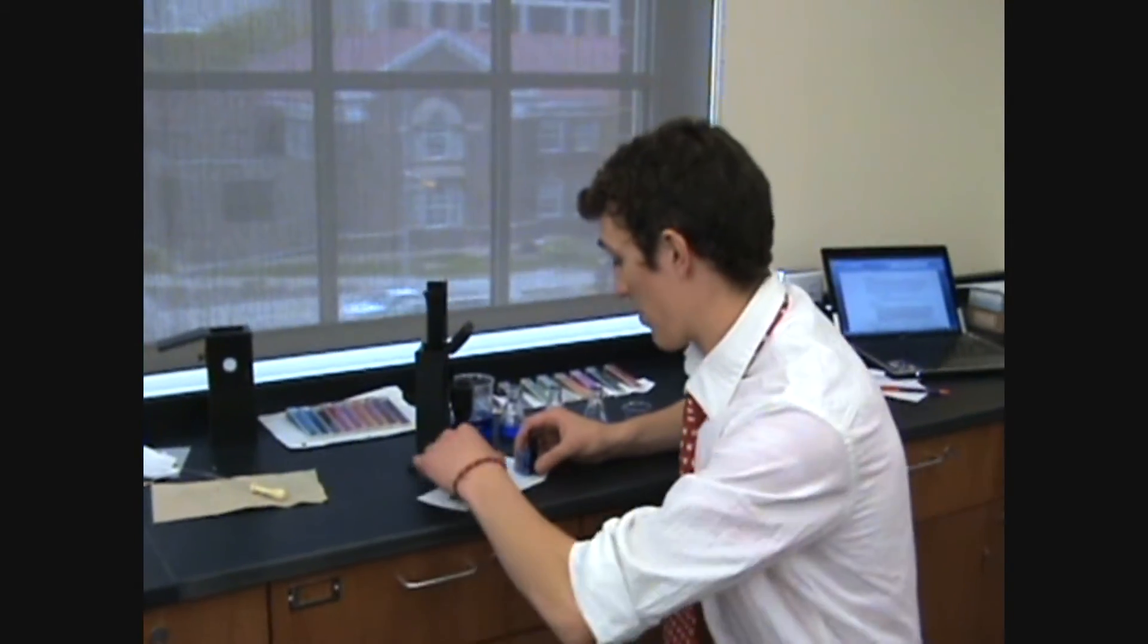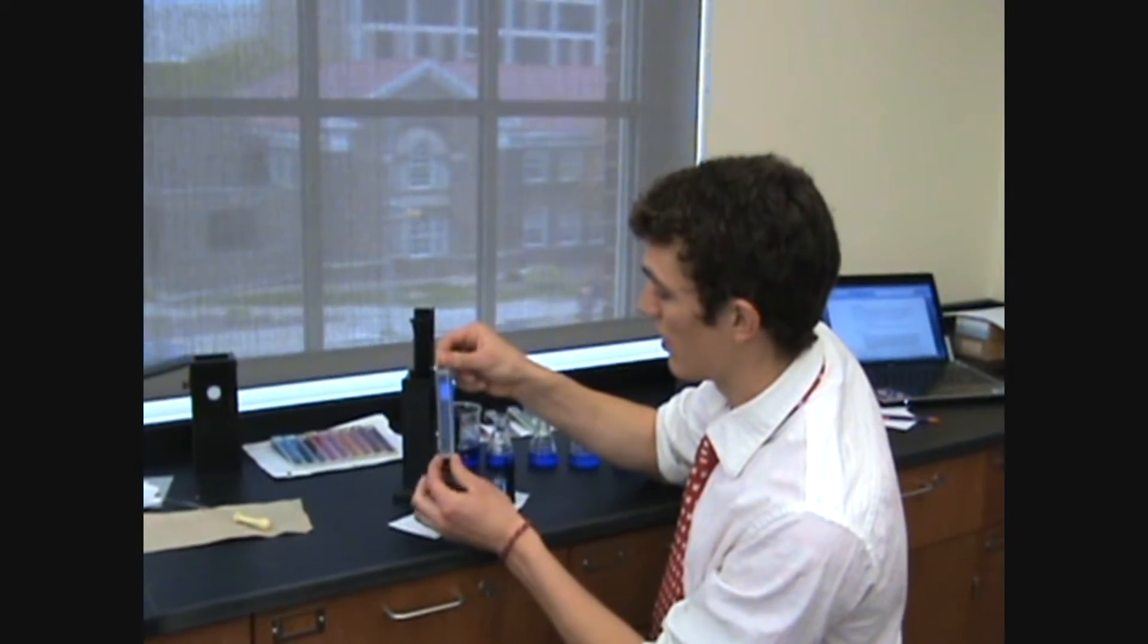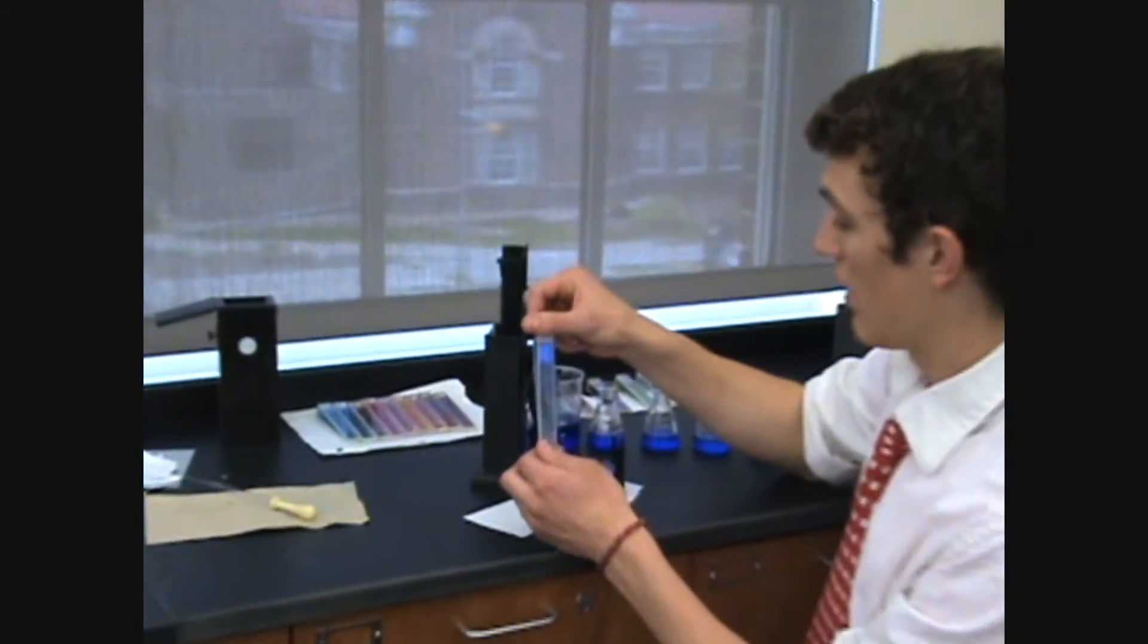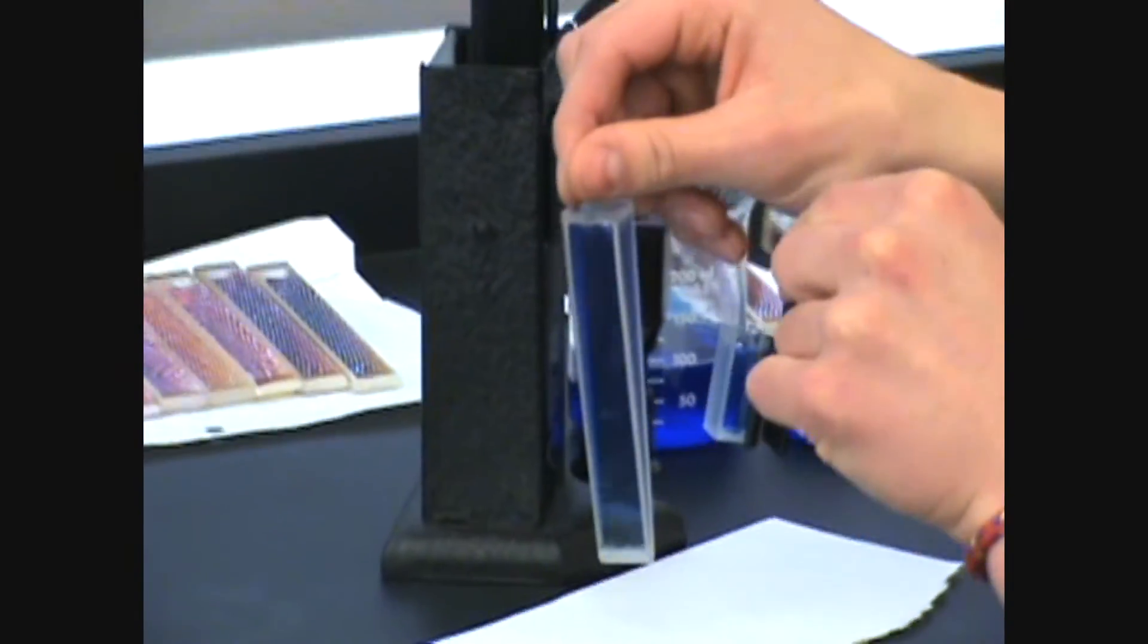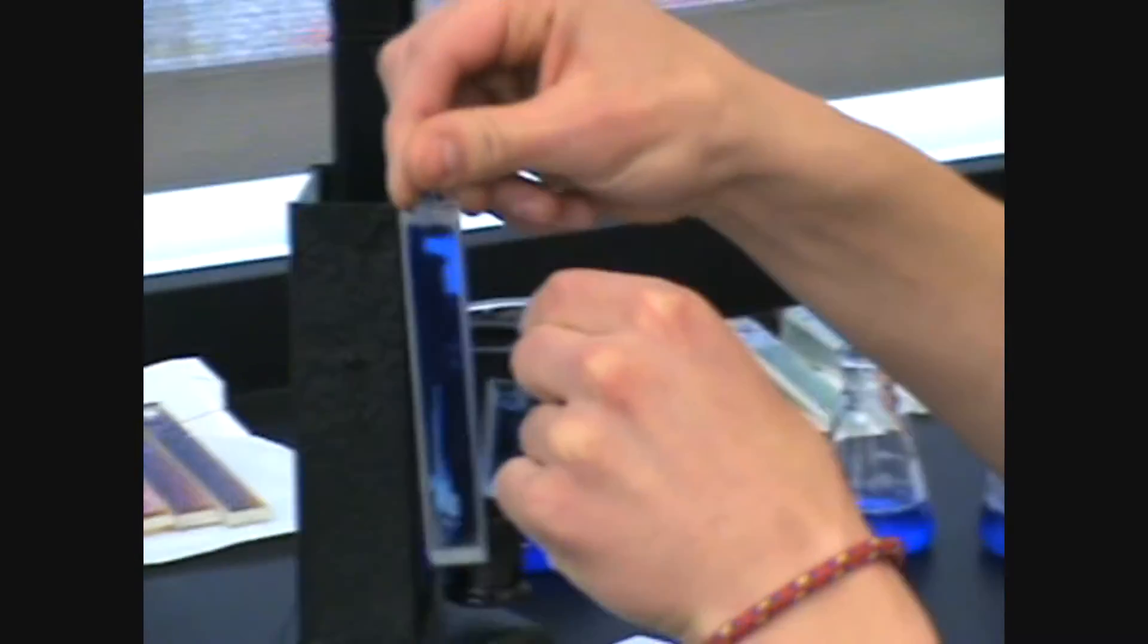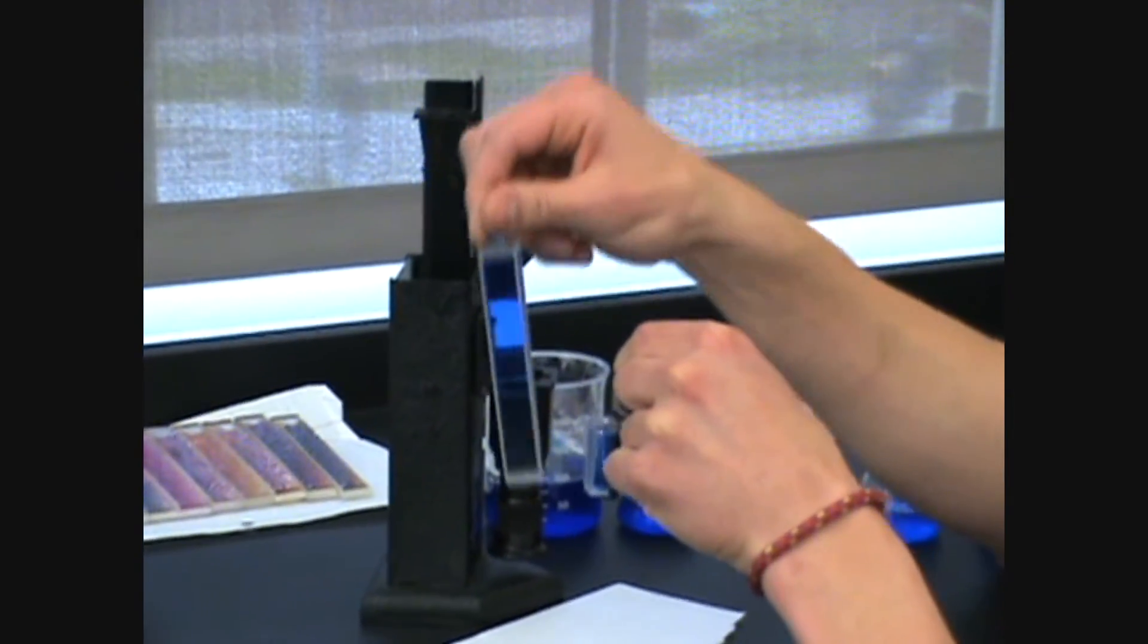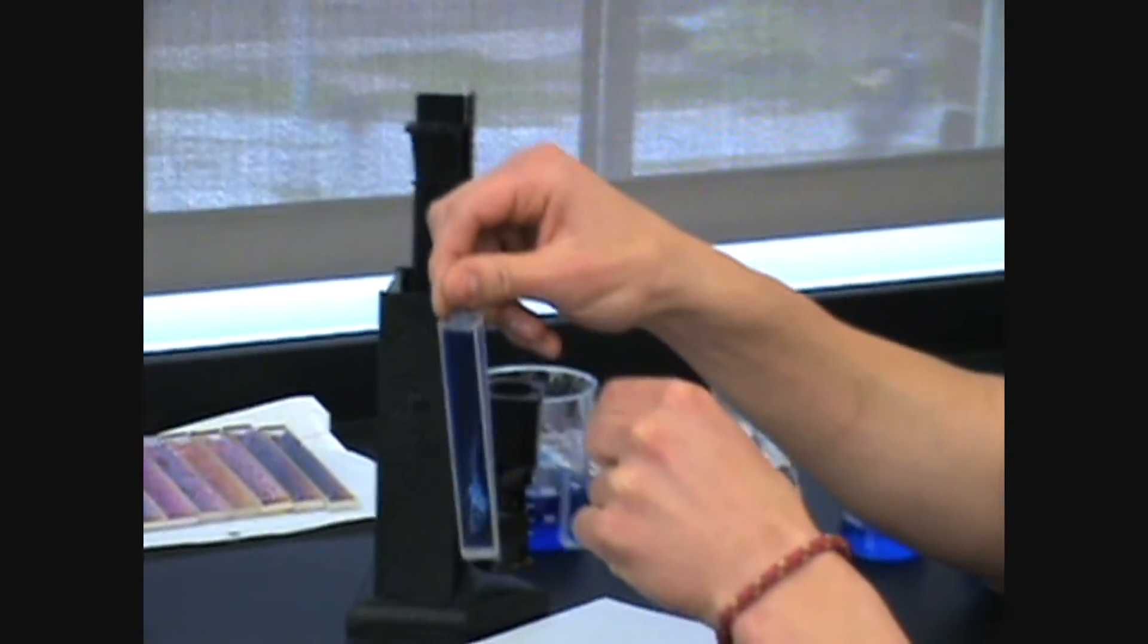So, with a colorimeter such as the wedge type that we have here, we have a standard in this wedge-shaped cup. Now, here we have a smaller cup which you put your unknown in. And then, because it gets thinner at the bottom, you can adjust the height of this until the intensities just about match. And then, you can measure the width of your standard and be able to get an accurate description of the concentration.